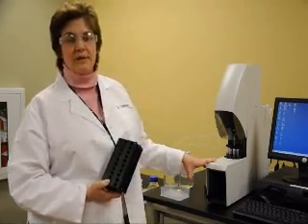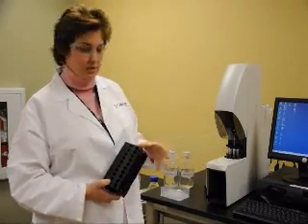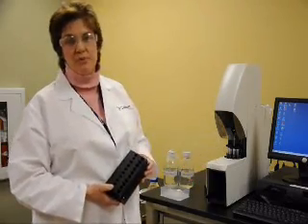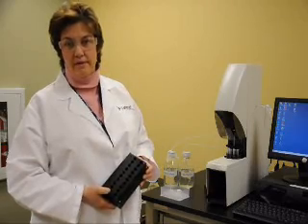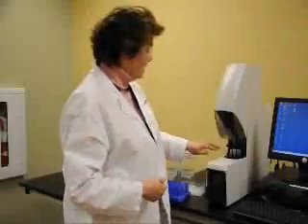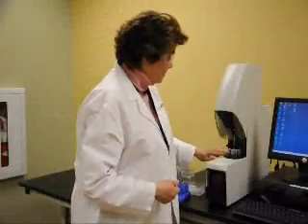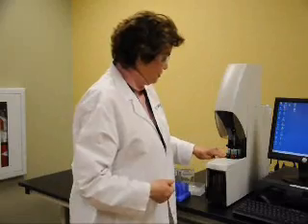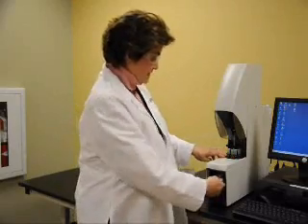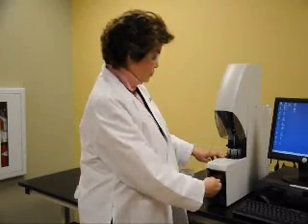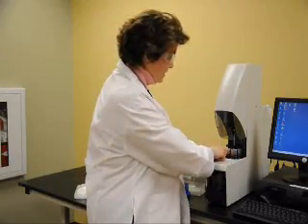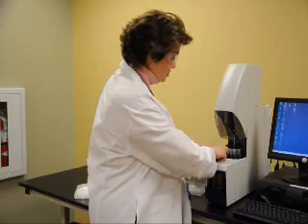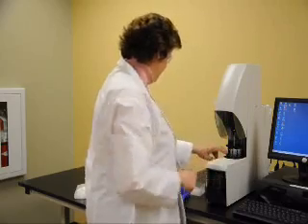One of the nice things about the system is that each of these samples could be running the same method, or they could be running a different method. Up here in these turret positions, I have samples in positions 1 through 5, so I want my SPE columns in positions 1 through 5.